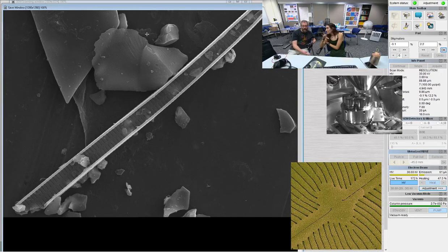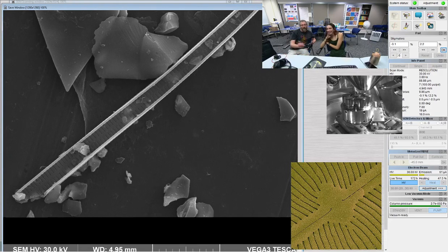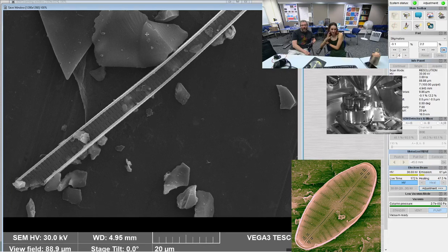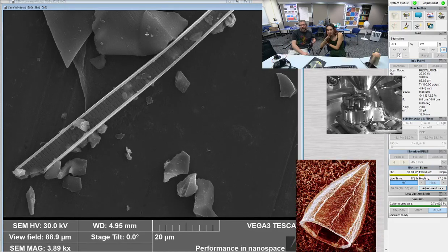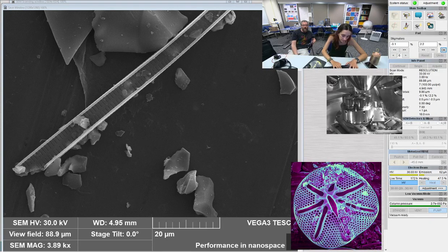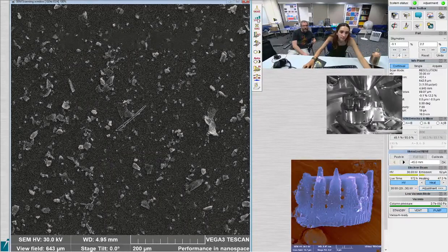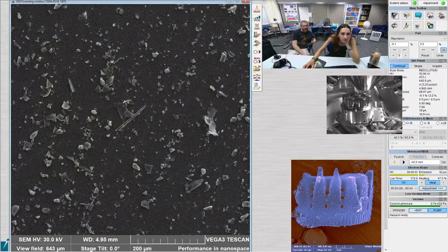Basically they learned to use the instrument such that they could walk away with the ability to do it. And if they wanted to use the SEM for their own research, they could just come in and use it. The primary objective was for everybody to have a separate project. One of the kids looked at fish scales, one looked at snake skin, and phytoliths was one of them. The last couple of weeks of the class were spent trying to put together a collection of images that could be used for publication quality. It was a fun, practical, hands-on experience class that I enjoyed teaching.